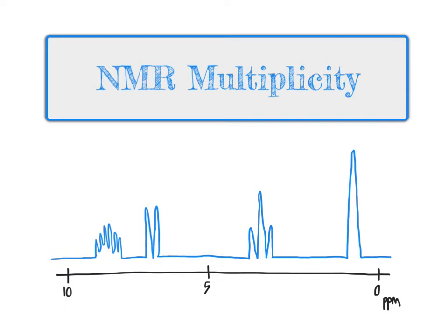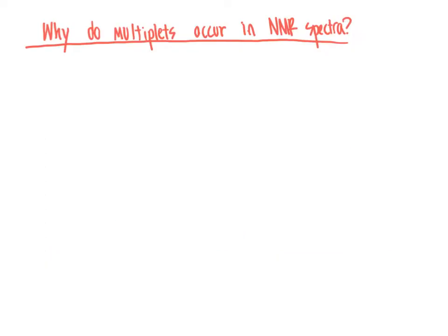We will get into, in a moment, why we don't typically observe carbon-carbon multiplicity. And we'll go through some of the details of how you can use this to help on our journey of solving chemical structures.